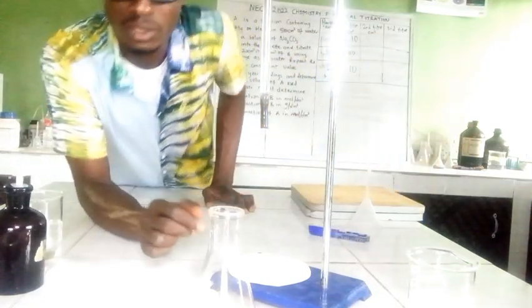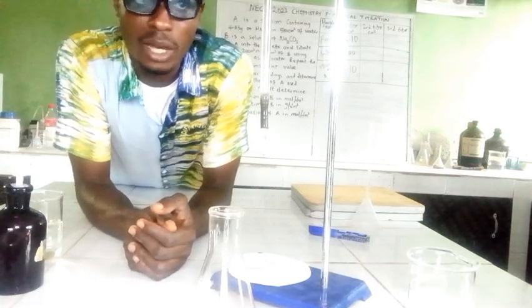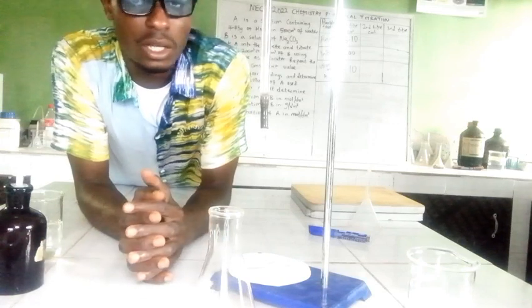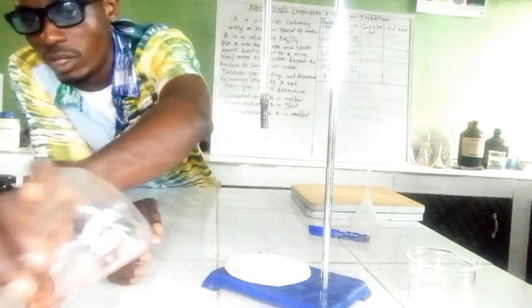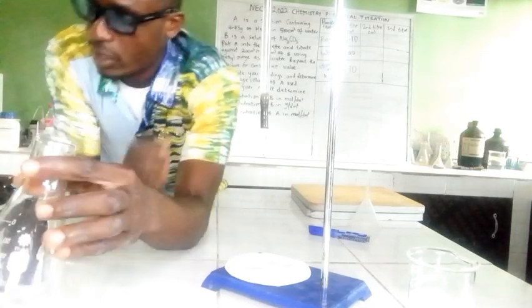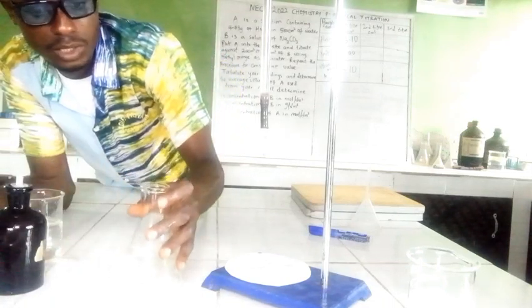So I can continue the titration without refilling the burette back to zero. I can still see more of 13. In fact, I can see 13 in 3 places in 50. So I don't need to. I think one burette will be enough for 3 titrations. So now let's move on. I can rinse that with water again, then proceed to the second titration.